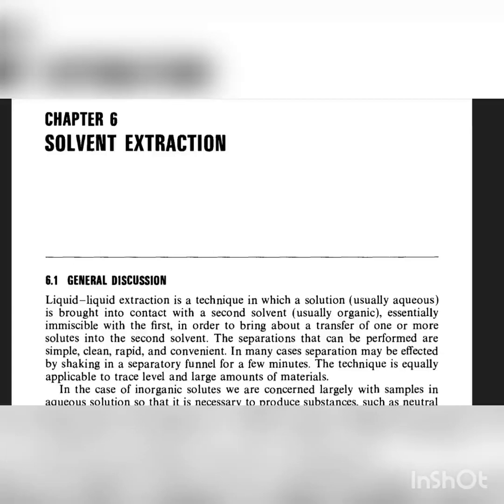Liquid-liquid extraction is a technique in which a solution is brought into contact with a second solvent, essentially immiscible with the first, in order to bring about a transfer of one or more solutes into the second solvent. The separations that can be performed are simple, clean, rapid and convenient. In many cases, separation may be effected by shaking in a separatory funnel for a few minutes. The technique is equally applicable to trace level and large amounts of materials.